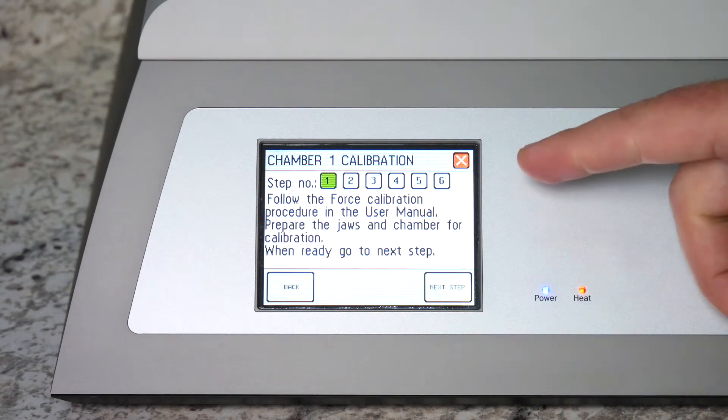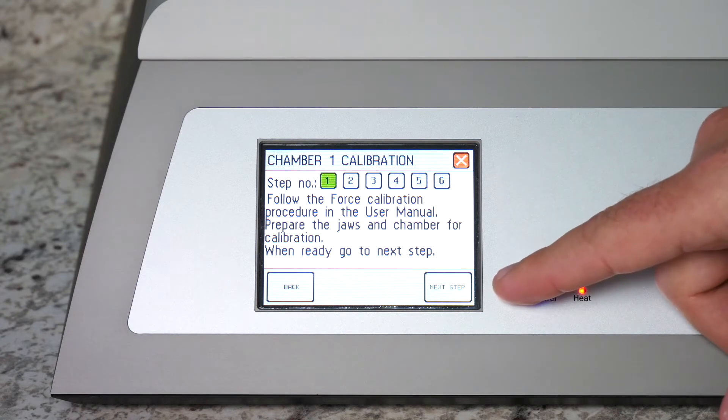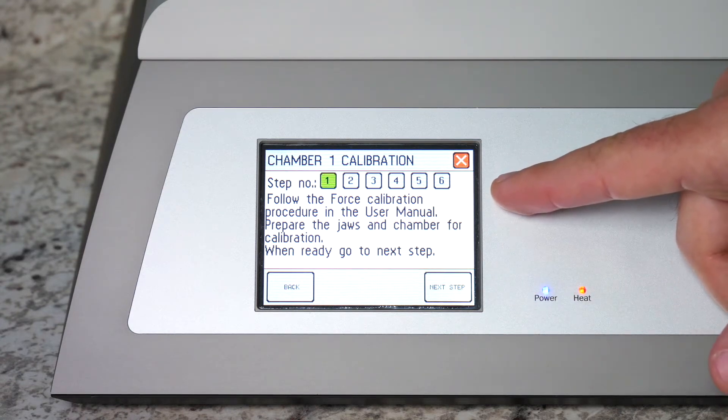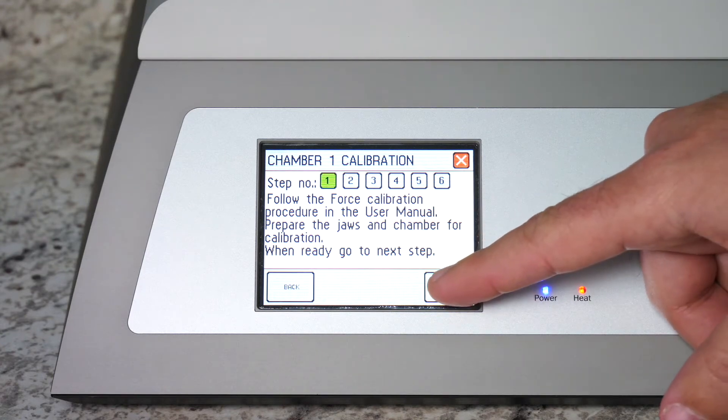This will take you to the calibration menu which is a six step menu but you really only do a couple things. Step one tells you to follow the procedure in the manual but instructions are also provided in the menu here. Hit next step.